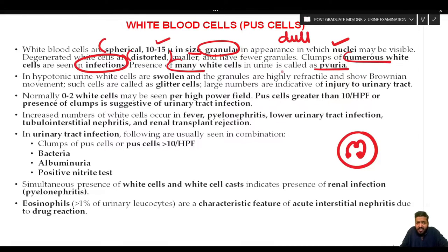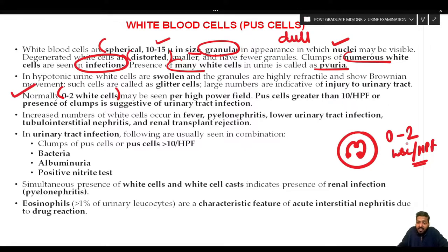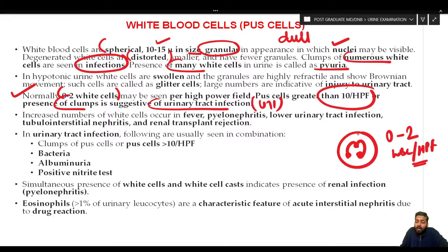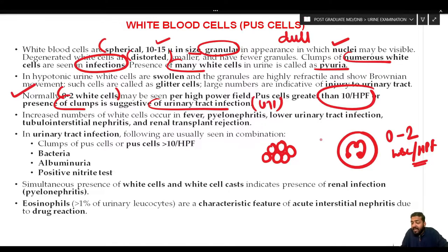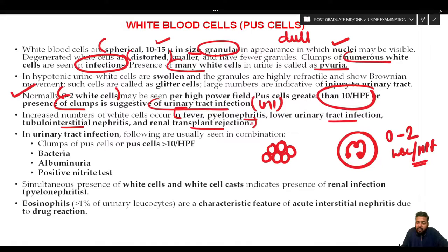Normally zero to two WBCs per high power field may be seen. Pus cells greater than 10 per high power field, or presence of clumps, is suggestive of a urinary tract infection. Increased WBCs are seen in conditions of fever, pyelonephritis, lower urinary tract infection, tubular interstitial nephritis, and renal transplant rejection.